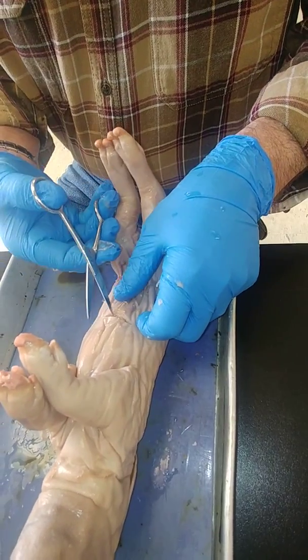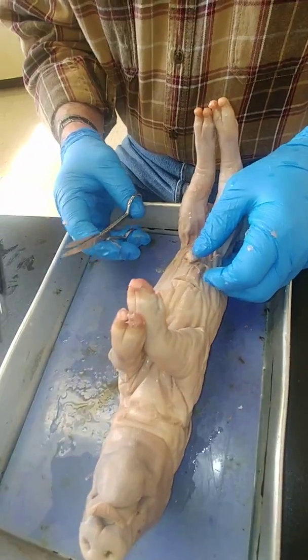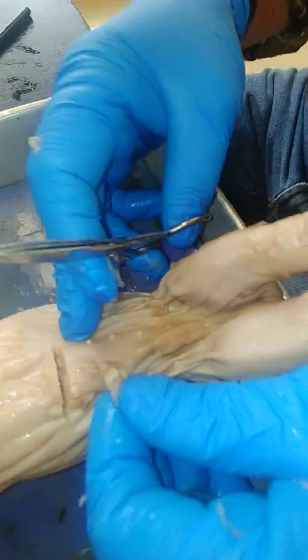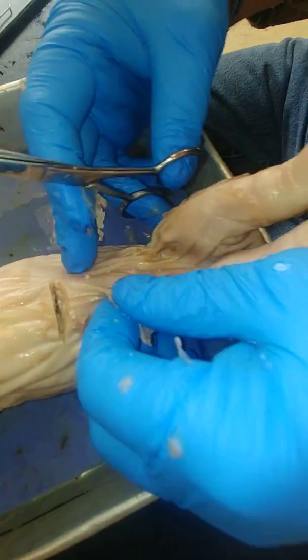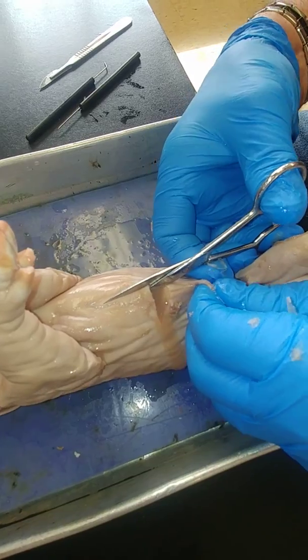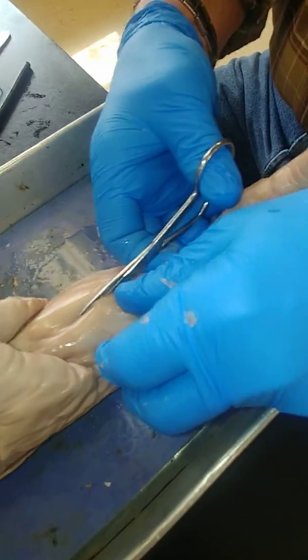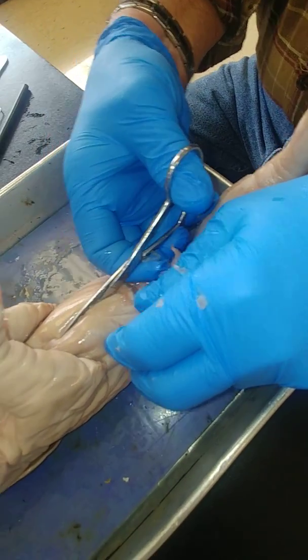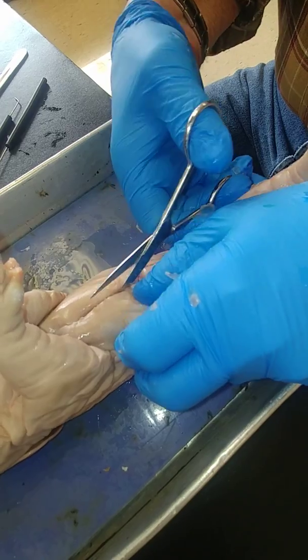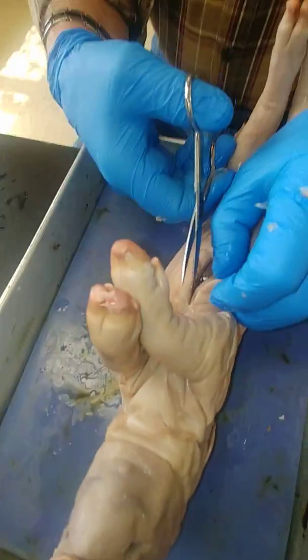Going to dissect the fetal pig. And what I've done first is made an incision here right above where the umbilical cord was attached. And we're going to use our scissors. And the reason we're doing this is because you guys didn't get a chance to do any major dissection. We were going to do the rat with biology, the mink with the juniors, and the fetal pig with the seniors.